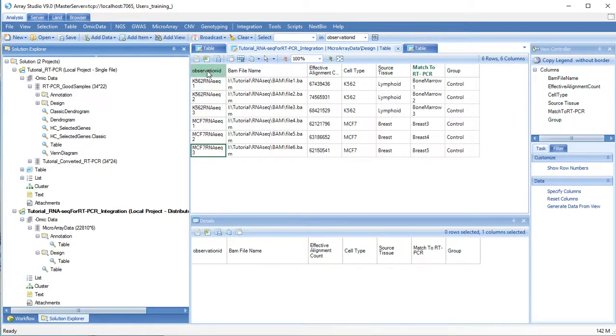You will want your data to be properly normalized and transformed. We like to use upper quartile normalization and log2 transformation with a small pseudo count. These data have already been normalized but not transformed, so let's do that.